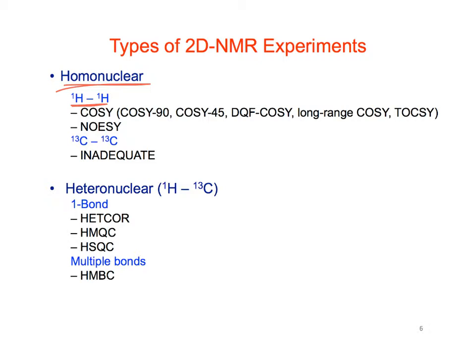All right, the first experiment we'll look at is called the COSY. You've probably seen these before, but there's a bunch of different variants of that.